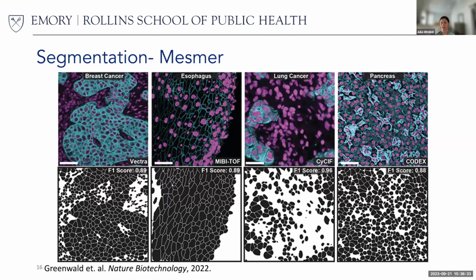I think that's something that isn't actually dealt with at all at this point in time. I think that people who are doing this analysis assume that there's a certain amount of error in the way that the cells are segmented, and hope that on average it sort of cancels out for the different types that they're looking at. But being able to capture that would require a segmentation algorithm that is specifically trained for identifying cells that are dividing. Big things like Mesmer haven't been trained to do that. So somebody would have to train their own neural net to look specifically for those types of cells, which I think would be super worthwhile to do, but nobody's done that yet.